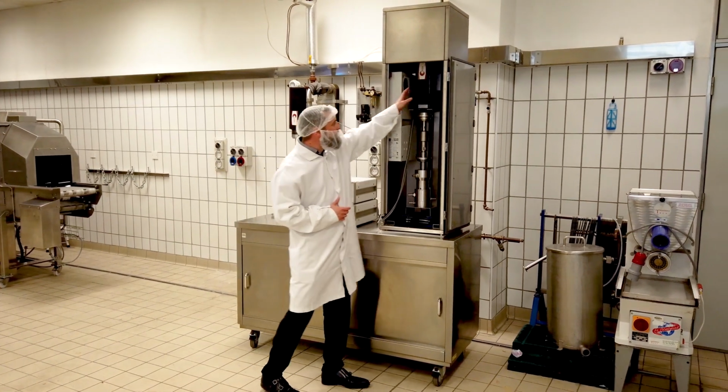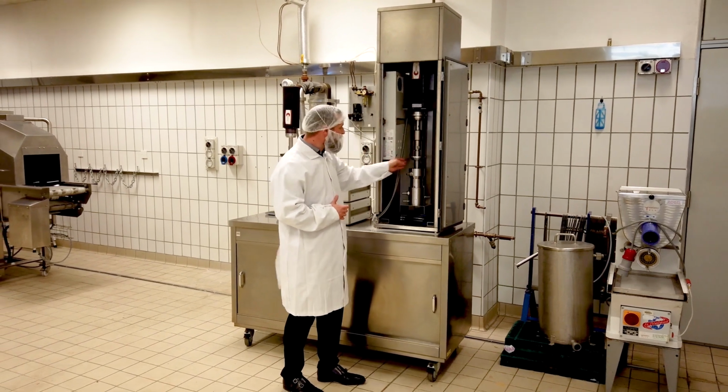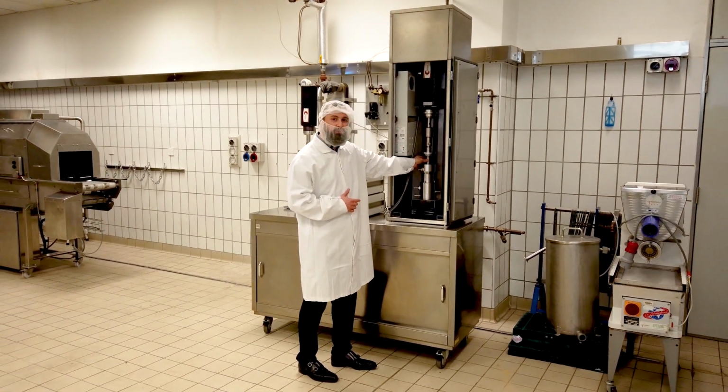The way the technology actually works is we will have a signal generator, and the electrical signal will be passed through to the transducer. This converts the electrical energy into sound waves, which can then be propagated into the liquid media via the sonotrodes.